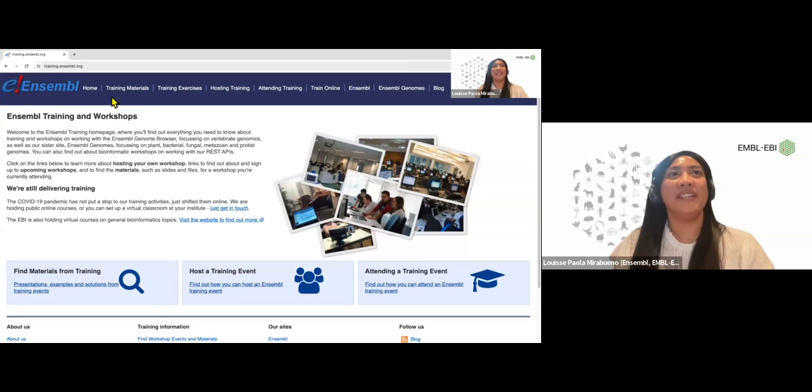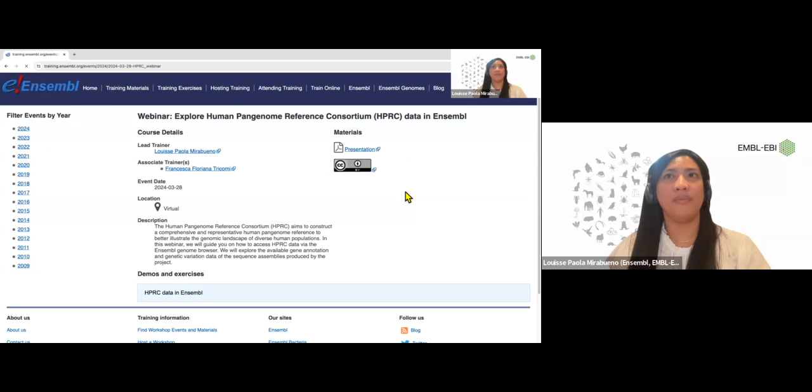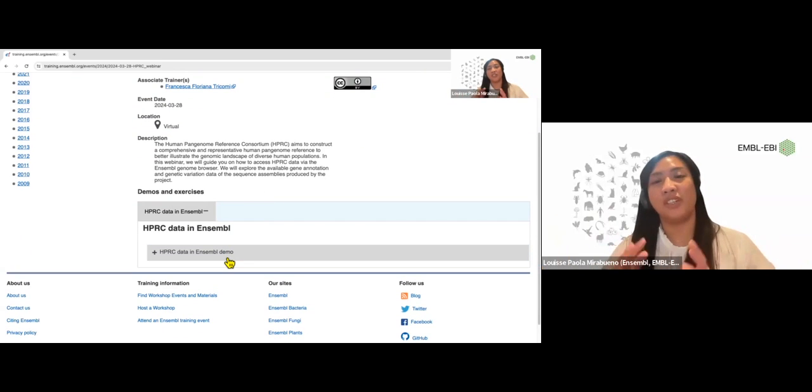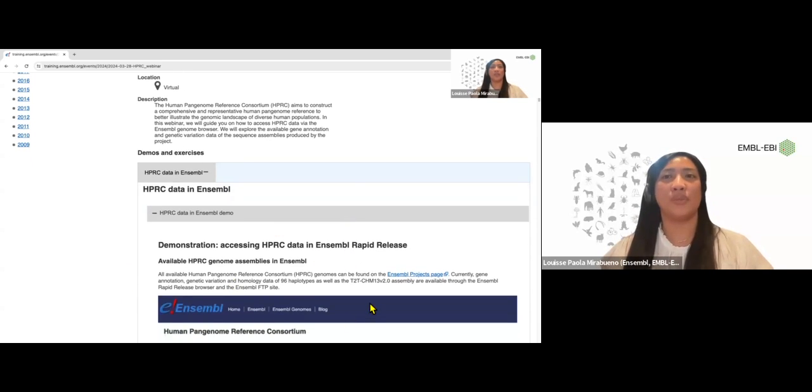At the top of the page, there is a link that says training materials. If you could just click that link, all of our materials are in this first link here, the one that says webinar. On this page, you can find my slides on the right-hand side. This is just a PDF version of what I'm going to talk about. But at the bottom here, under demos and exercises, these are actually quite useful. These are walkthroughs for the live demonstration I'm going to do towards the end of the webinar. So if I've gone through an example too quickly, you can always ask me to repeat it, or you can look at the walkthrough in screenshots in your own time on the training page.